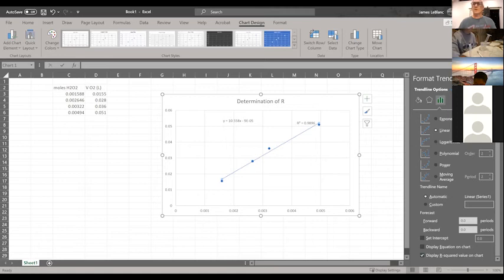All right, so I'm going to go back and look at how this fits in with our work. So from the slope of the line, we had moles of H2O2 and volume. Oh, I just thought of an error I made. Anyone spot what it is?